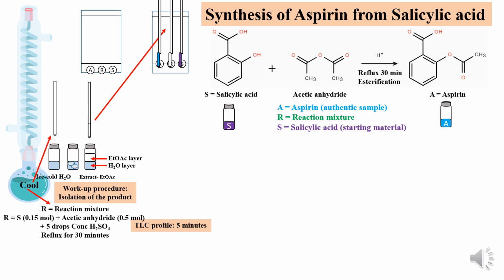Now, how do you know when to stop the reaction? This is a very well established procedure, the synthesis of aspirin from salicylic acid. So we know the reaction conditions as well as the reaction time. But what about an unknown reaction? What if this reaction was unknown? How do you judge the reaction time or the reaction completion time? And that is where the TLC technique comes in handy.